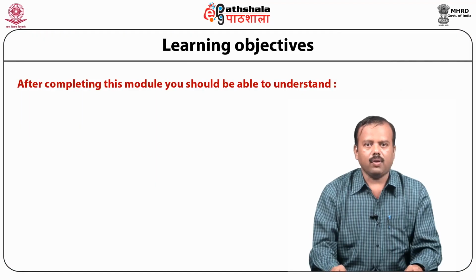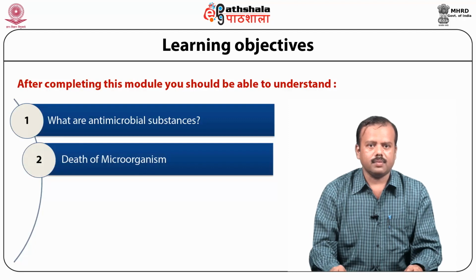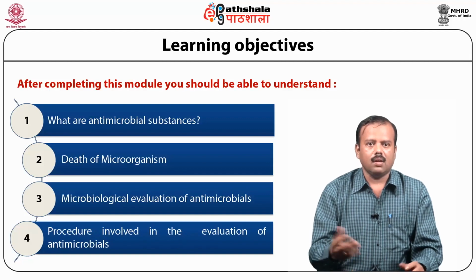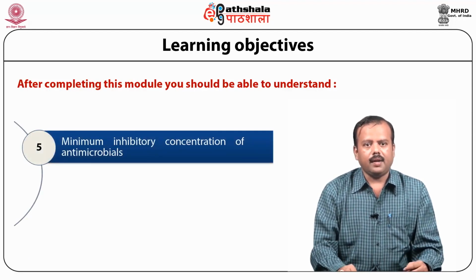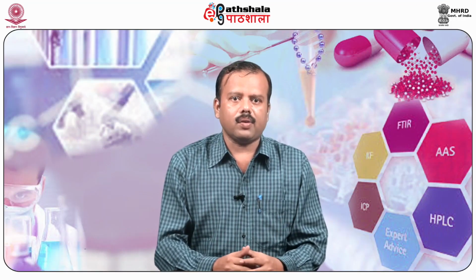After completing this module, you shall be able to understand what antimicrobial substances are, death of microorganisms, microbiological evaluation of antimicrobials, the procedure involved in the evaluation of antimicrobials or disinfectants, minimum inhibitory concentrations of antimicrobials, and tests for new disinfectants.